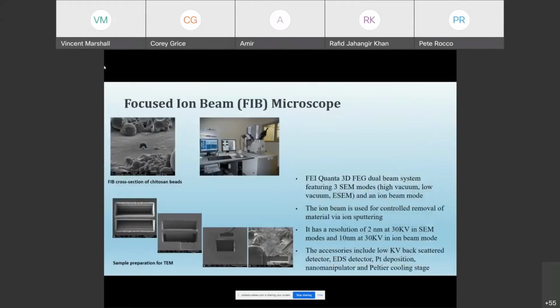And then we touched a little bit on this, the focused ion beam. So on one of our scopes that is an SEM that can do everything that we've already discussed, it also has another column installed. So instead of using electrons to bombard the sample, it uses a beam of controlled gallium metal ions. Because of that, you can use it for imaging, even though it's somewhat destructive, but you can also use it to manipulate your samples. So you can use it in a gentle way to do some of the polishing on the surface locally, like I showed you in one of the previous images. But you can also use it to actually prepare samples and do other kinds of microscopic machining.